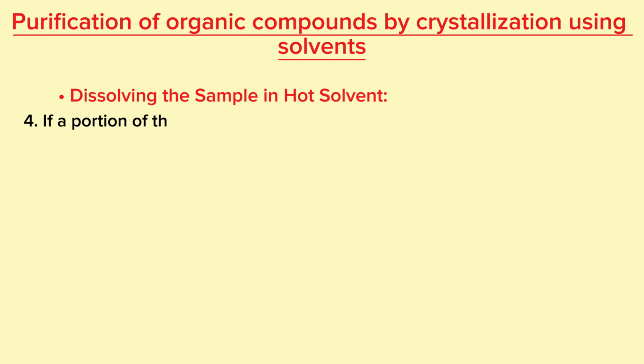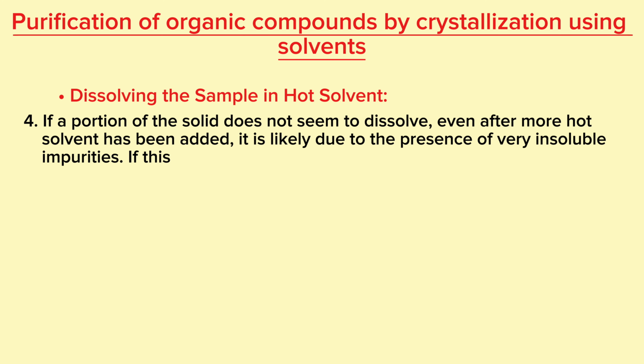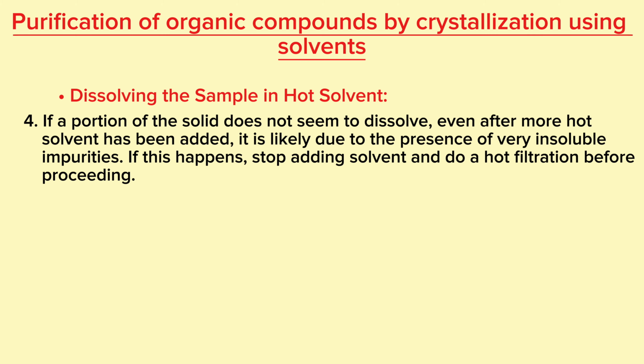If a portion of the solid does not seem to dissolve, even after more hot solvent has been added, it is likely due to the presence of very insoluble impurities. If this happens, stop adding solvent and do a hot filtration before proceeding.